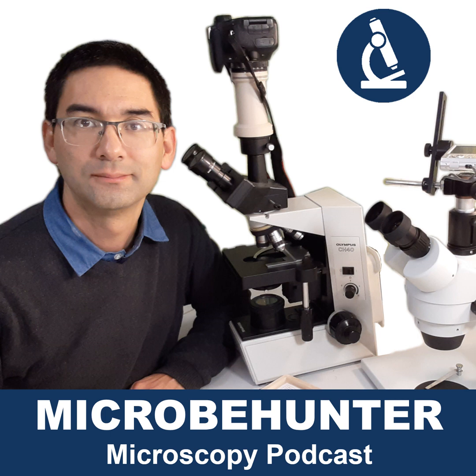So they basically allow you to see transparent structures much better. And the answer is the following. If you go to a company and ask for phase contrast or DIC, then most likely the answer will already be given to you simply when they tell you the cost of these devices. Generally, DIC, I mean, I didn't look it up, but I would be surprised if it would cost less than several thousand euros or several $1,000s. Okay, so for amateur use, you gotta have a thick wallet for that.